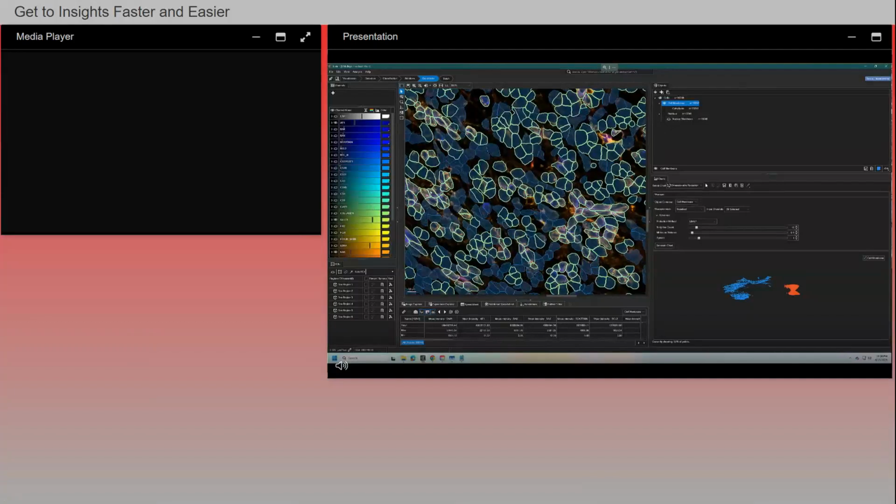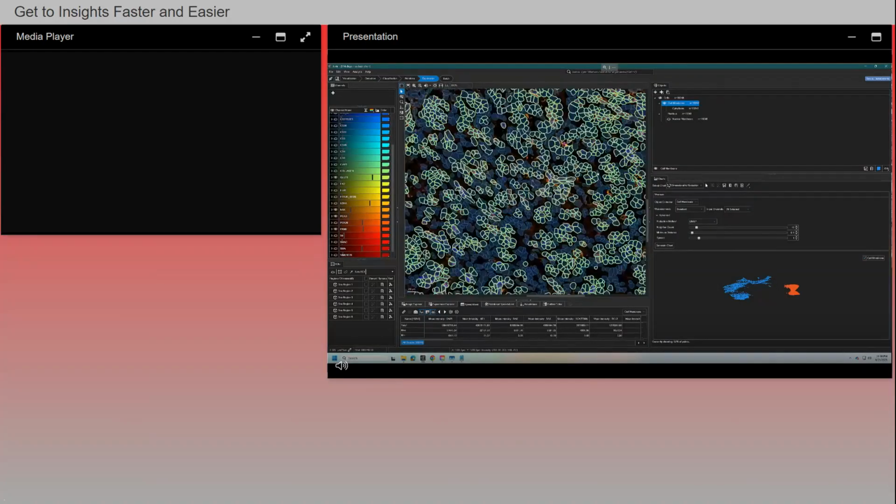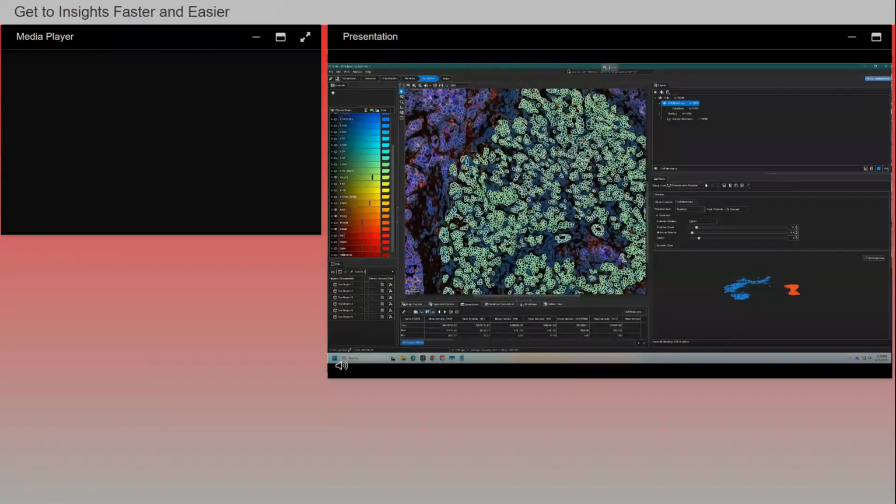So there are these 3 channels I'm looking at. So in this example, a lot of these cells that are low for PKM2, which is the red channel like these, are indeed what I'm looking for to classify into normal cells. So a lot of these cells that I can in one go train all these cells to belong to a normal cell group.